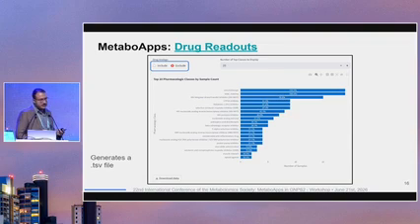If you're looking at specific analogs, then definitely include them and see what's been found in your samples. And you can also change the number of classes that are going to be shown on your bar chart. In this case, the default for the app is the first 20 pharmacological classes.